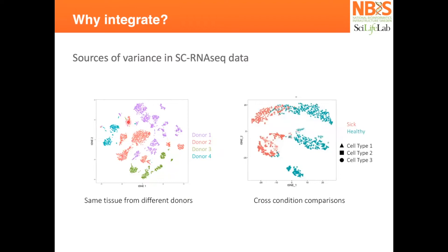For example, here you have PBMCs from four different donors and they are completely separated. Here is another way of seeing the batch: the cells are actually in the same cluster, but the cluster is divided by donor. You can clearly see that on the left you have the healthy, and on the right you have the sick patients. That can also be biologically meaningful, but you would not expect or want to have the cells divided by batch like this.